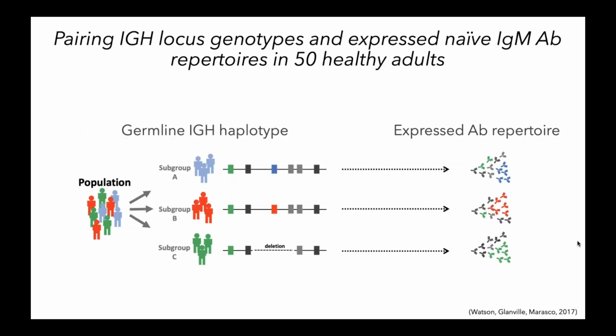Okay, and so in the final minutes, I'm going to sprint to the finish line here, as I know I'm approaching time. And so I wanted to give you a little indication of some of the things that we're working on now in my lab, thinking about, okay, now we've developed this tool, how can we use it to better understand the antibody repertoire and the variation we see in the response? And so we wanted to begin by asking some simple questions about, can we find correlates in the genome to the repertoire, much like you would do in a standard eQTL study.